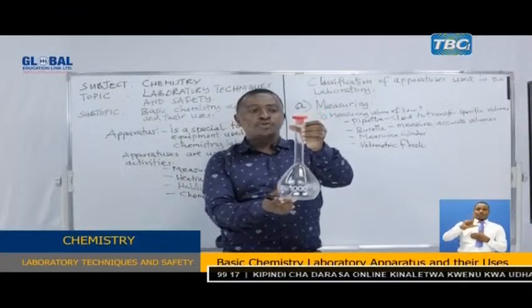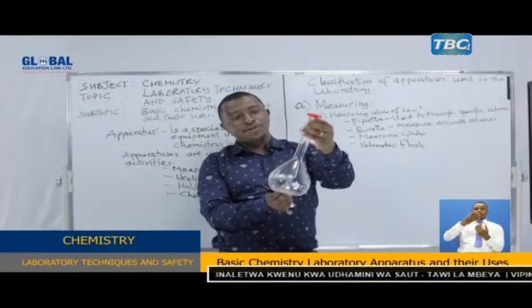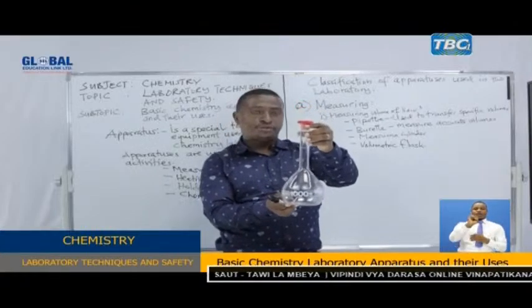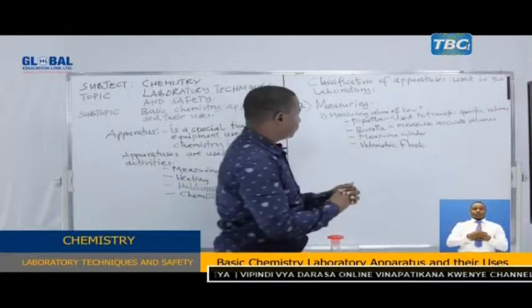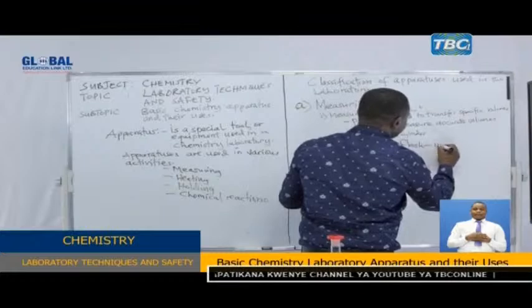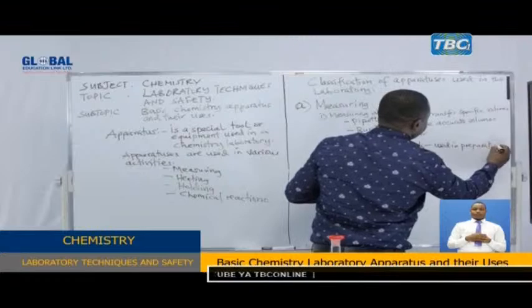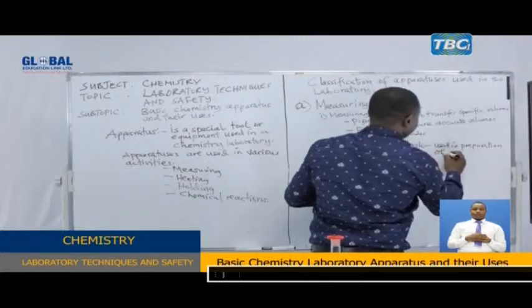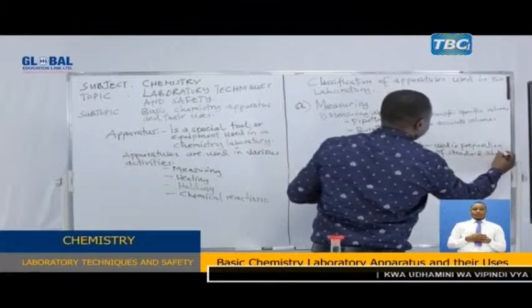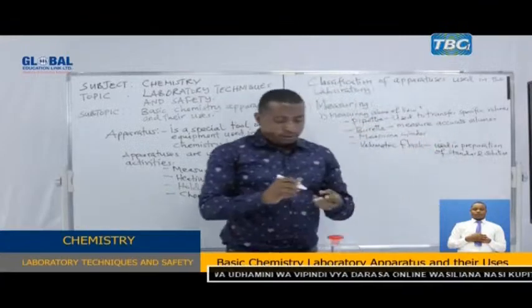This one is also used to measure precise volumes of liquids, and it is also used in preparing standard solutions.